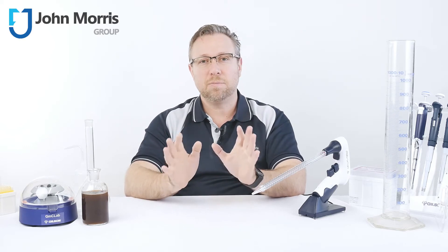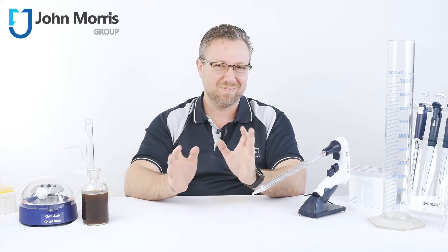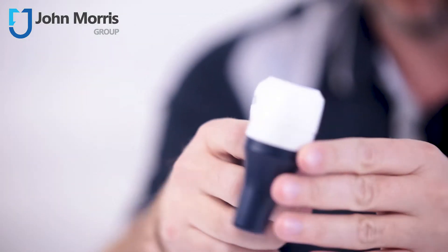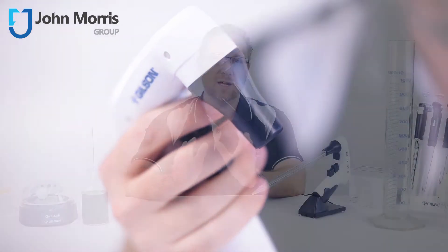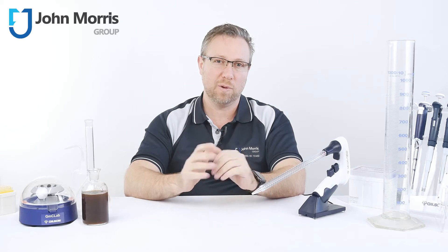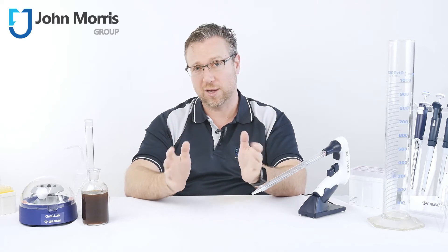Now there are plenty of basic pipette controllers in the market which more or less do the job, but today I wanted to introduce the Gilson Macroman. This little feature-packed beast boasts a range of handy advantages in an ergonomic form factor, all at a surprisingly competitive price.